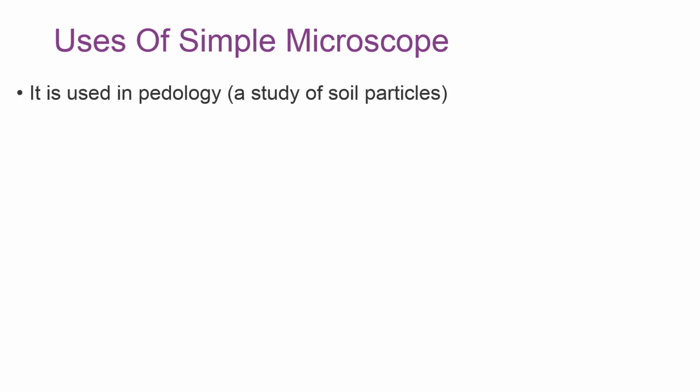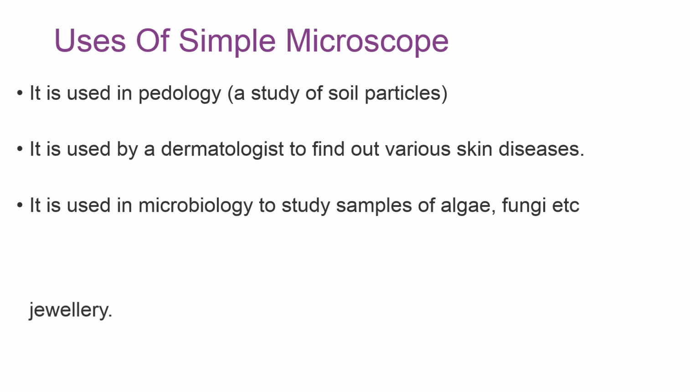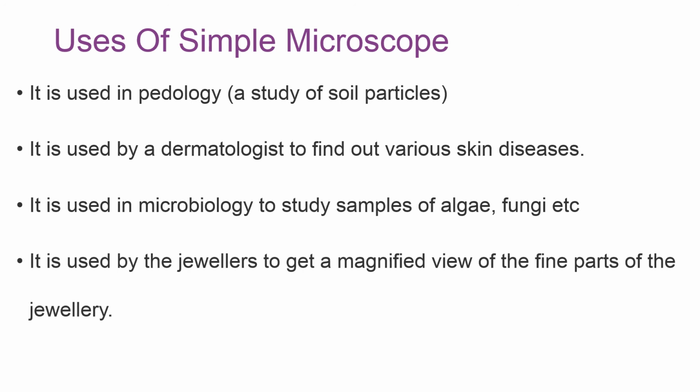The microscope is used to study soil particles, and that kind of study is called pedology. It is also used by dermatologists to find out various skin types or skin diseases. It is also used in microbiology to study samples of algae, fungi, and the rest. It is used by jewelers to get a magnified view of the fine parts of jewelry.